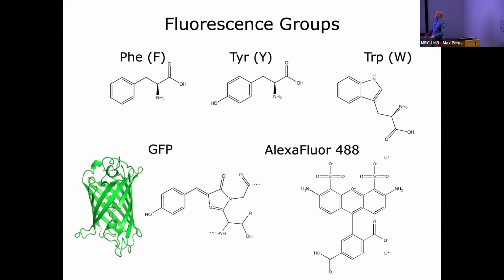All right. So the groups that you get, you can see they're all ring structures, and that tells you something about the electronic structure. Including, say, GFP down here at the bottom, where the ring is the fluorescent group, formed by conjugation of the amino acids, and different forms of GFP have different substituents, different amino acids, which change how the electrons are distributed across this ring system. And then in the corner there is a synthetic fluorophore.